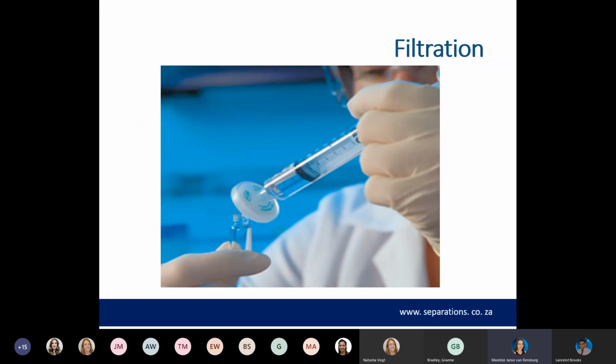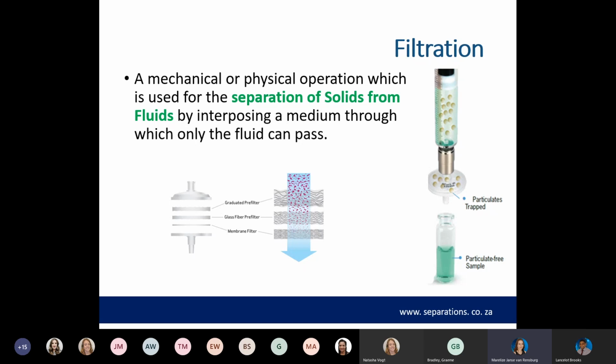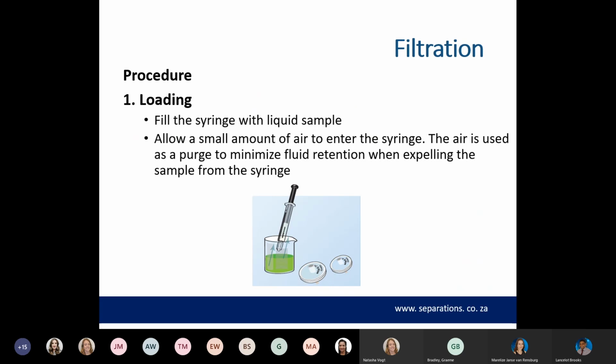Next up, we have filtration. Filtration is a very simple and purely mechanical technique where particles above a certain size get removed from the solution. Using a syringe filter is easy and it doesn't take very long. You simply fill the syringe with the liquid sample.